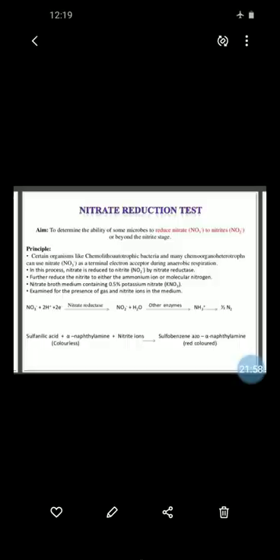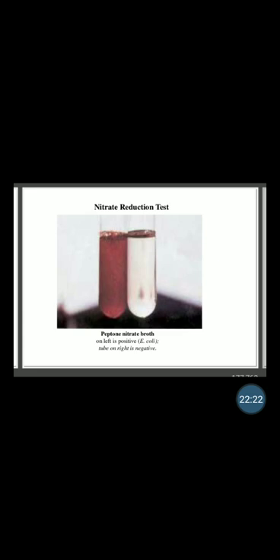Here we can see the reaction in the presence of the enzyme nitrate reductase. Sulfanilic acid plus alpha-naphthylamine plus nitrite ions, which are colorless, give the sulfobenzene azo compound, that is a red color complex. If there is formation of red color, then this test is positive.